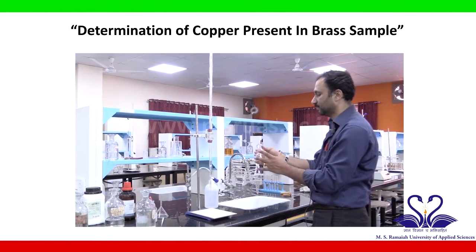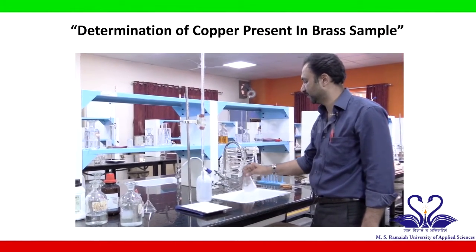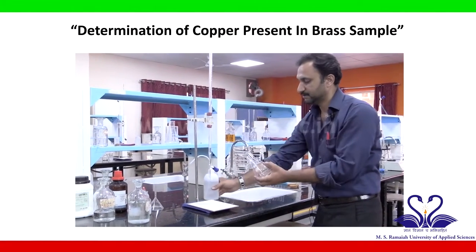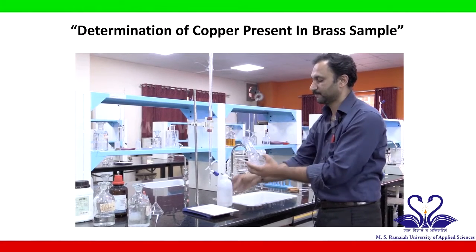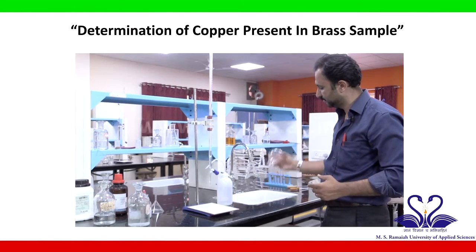Wash thoroughly with plenty of tap water, because ammonia should not interfere in your next reaction. Dry it as much as possible.